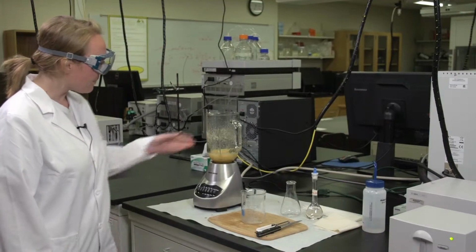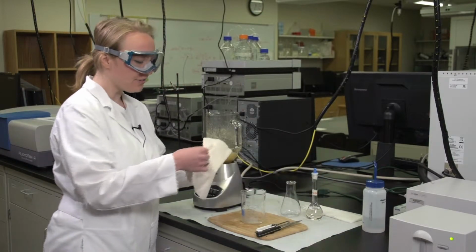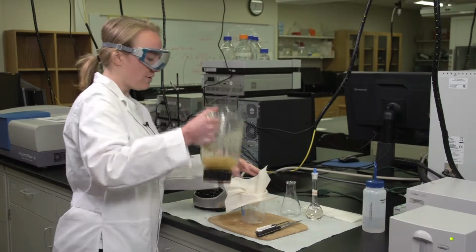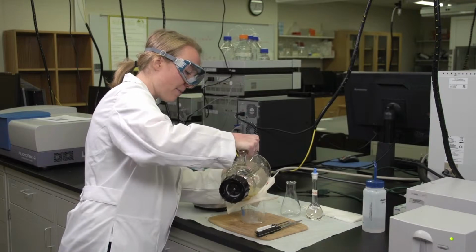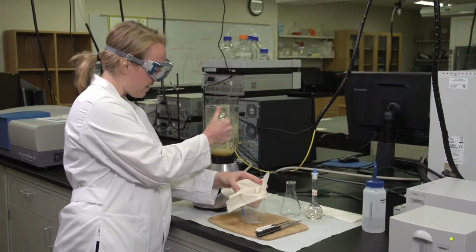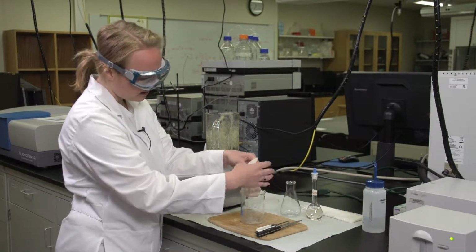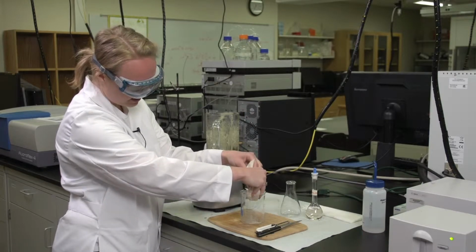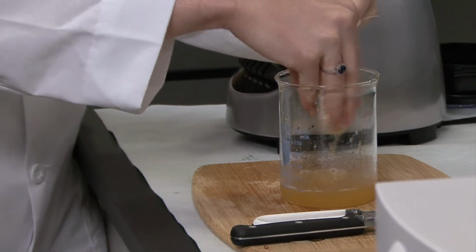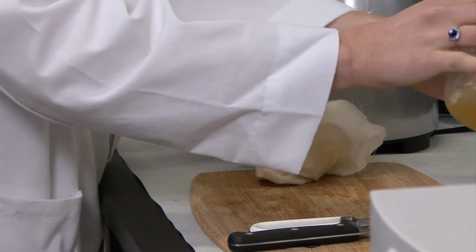Now that you've pureed the apple and ice water solution, we're ready to pour it. We'll want to filter it through a cheesecloth. Just put the cheesecloth in a beaker, and then pour this apple solution in there. It might not go through very easily, so you might have to squeeze the cheesecloth. Make a ball and squeeze it until the puree comes out. And then pour this into an Erlenmeyer flask.